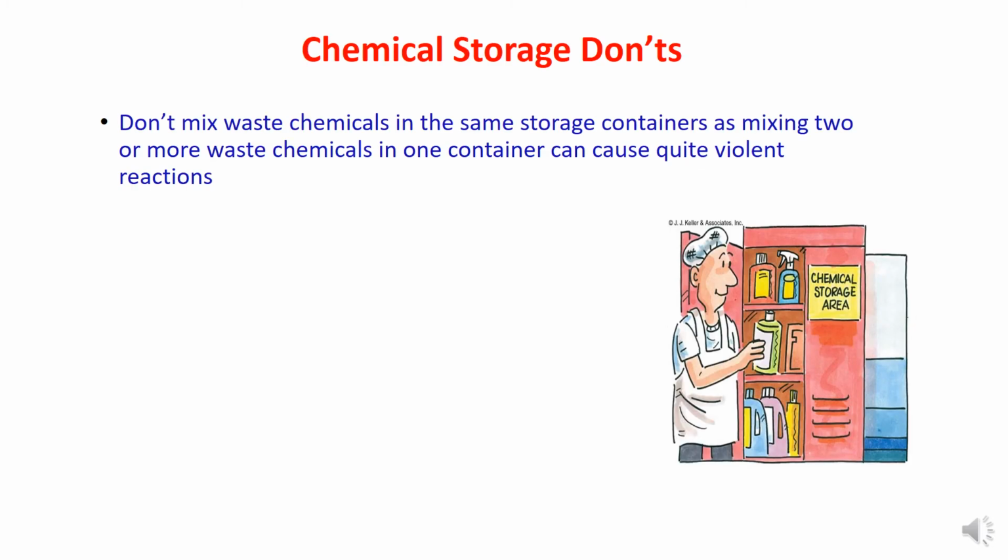So of course, as I mentioned before, we can store these chemicals in the storage area, particularly in the store or in the cabinets. But what are the chemical storage practices we should not do? We should not do these things.